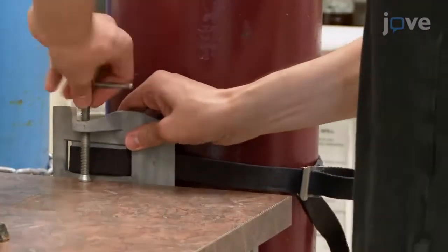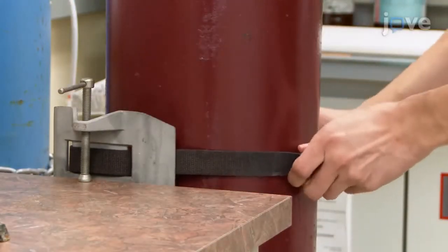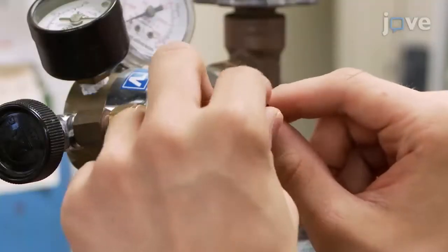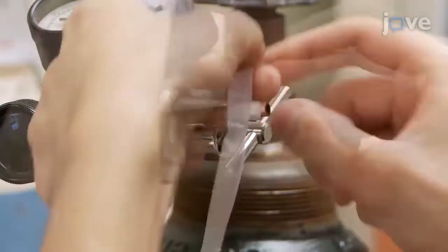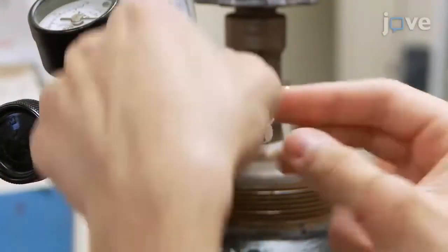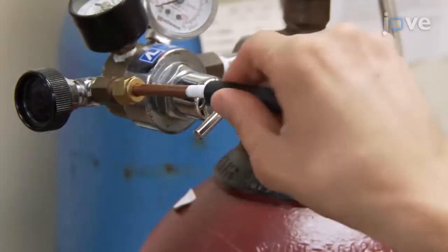Safely install a nitrogen gas tank close to a bench on which there is enough space to set up the nitrogen station. Connect a piece of tubing to the tank that is long enough to reach the area where the station will be built. If necessary, apply Teflon tape at the output of the tank to avoid any leakage.